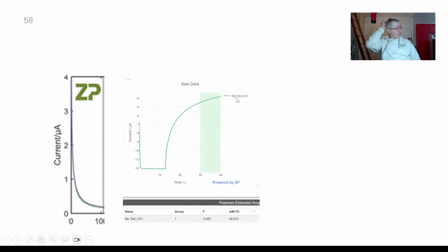And it may not be your fault. It may be because they've scanned the QR code for glucose, when actually I'd want them to scan the QR code for amperometry, and then I would want them to manually put in 650 millivolts. So the data's going in the wrong direction. It's easy for me to fix because you've sent me a well presented, detailed slide deck. It really helps me.